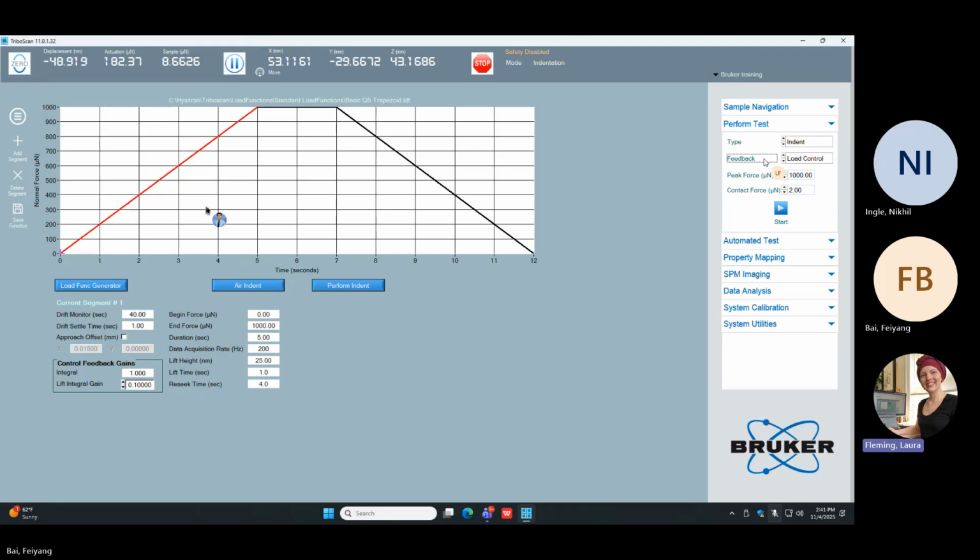So you'll often see in an open loop test that you set it to 10 millinewtons and it only goes to like 9,500 micronewtons. Open loop is not very repeatable because of the way that no feedback system works. Instead, we generally recommend the next one, which is load control. You can think of this as voltage control as well. The reason is that our sensor is what I would call a force-led sensor.